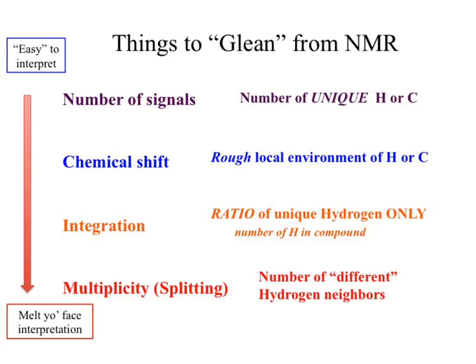The best way for me to describe all of this spectral information is that you are taking a puzzle and you are building the puzzle pieces. Once the pieces have been put together, then you can put together the puzzle. But really what you're looking at is all of these tiny little pieces that you have to build into slightly larger chunks that you can then use to build the whole structure. But you have to interpret at each of those stages.